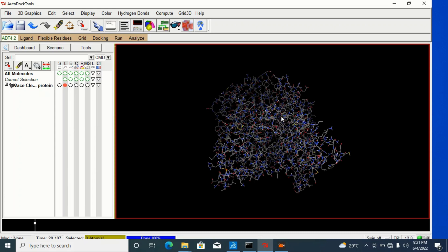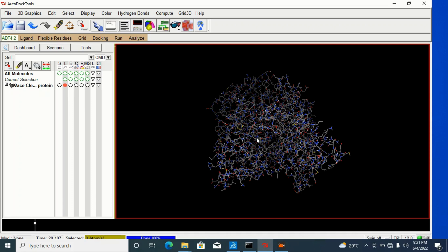So, what do I do? I just need to add few grids set up. Like I said, it is just targeting or trying to position your protein in such a way that the ligand will be directed to a particular portion for docking. Where the ligand will have to locate itself during the docking process. If you don't do so, the ligand will have a way of just binding to any portion or any side of the protein without locating the active site or where you want it to bind to. And it is at this particular point that if you have a site-directed or site-specific molecular docking, it is at this particular portion or time that you compare those features or put in those options in your protein and allow the docking to occur at your own preferred portion or preferred pocket.